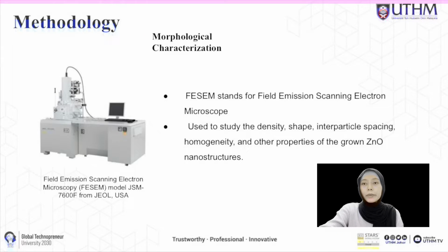Next is the methodology for morphological characterization. FESEM stands for Field Emission Scanning Electron Microscope, which is used to study the density, shapes, interparticle spacing, homogeneity, and other properties of the grown zinc oxide nanostructure.